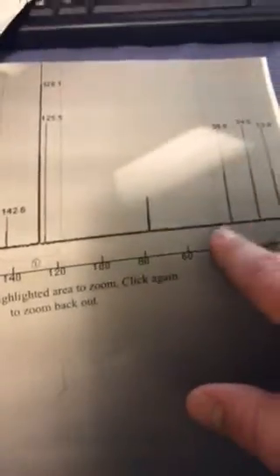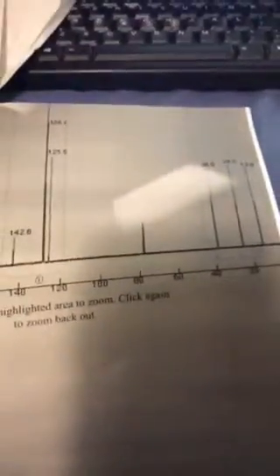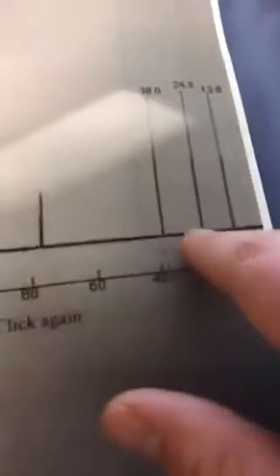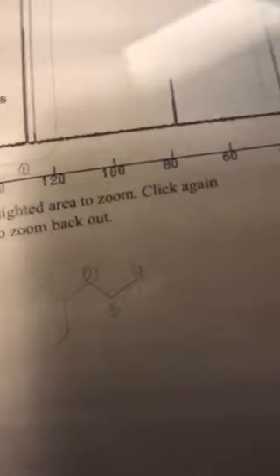And then it can be noted that the carbons that are closer to the ring, 2, 3, and 4, fall off in that order. Therefore, the carbons as labeled down here, 2, 3, and 4, can be matched to these peaks, helping to confirm our overall structure using 4 different methods.